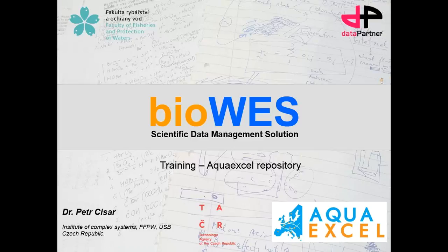And today we should repeat what we have learned last time. At the beginning, I will try to show you some extended features of the design of protocol template. Then I will show you how to create and fill the protocol. And finally, I will show you how to share and how to visualize the connected protocols.